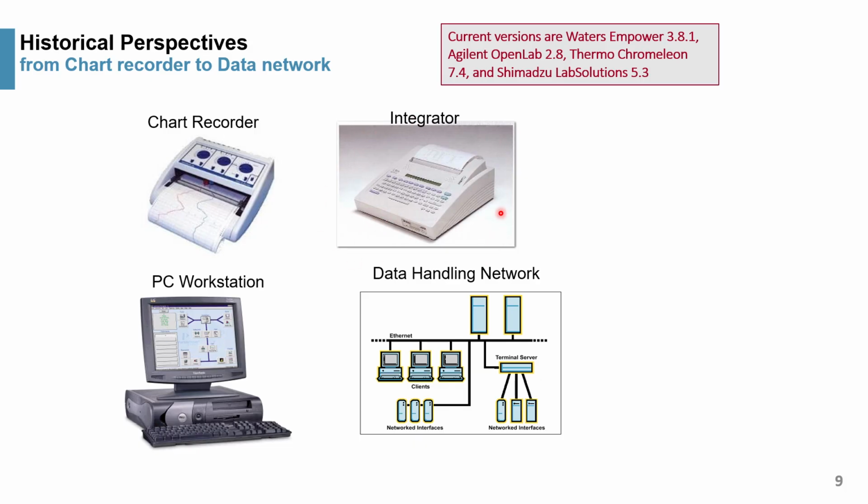Unfortunately, the electronic integrator's time frame was actually shortened by the rapid introduction of the PC workstation in the 1980s. First to debut was Nelson Analytical, which was acquired by PerkinElmer, which quickly migrated into data handling networks such as client-server networks.